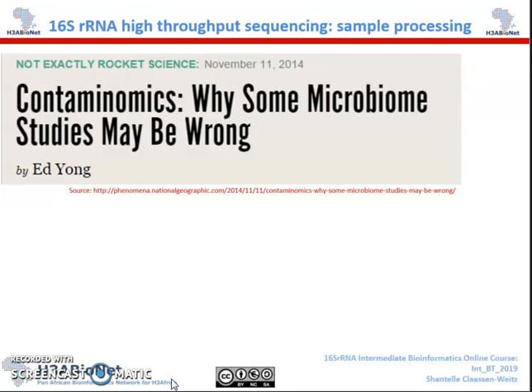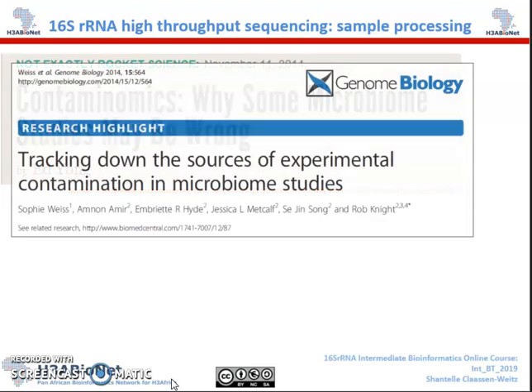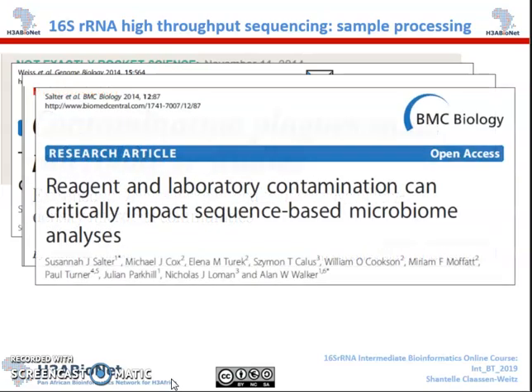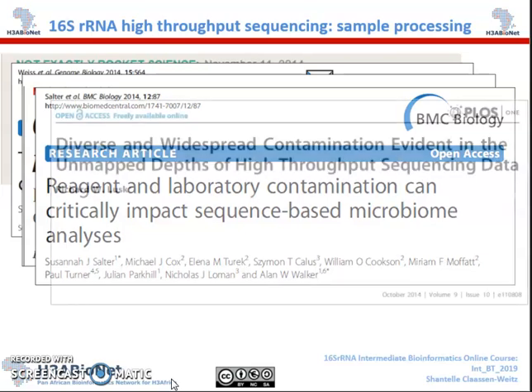In addition to the effect of DNA extraction on the bacterial profiles, for example, one kit extracts DNA from hard-to-lyse bacteria more efficiently compared to another kit, there is also the issue of what is called sequencing contamination. A number of studies have shown that the actual DNA yield resulting from extraction seems to predispose the reaction to an increased level of background or contamination profiles observed during sequencing.